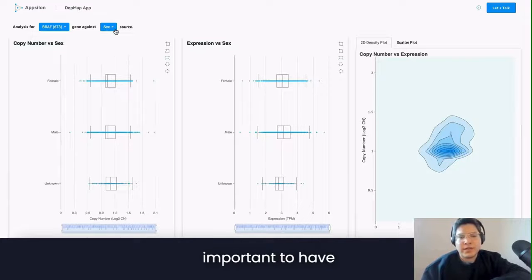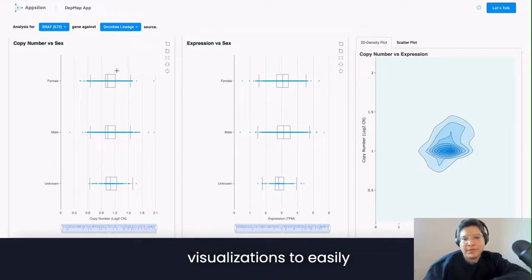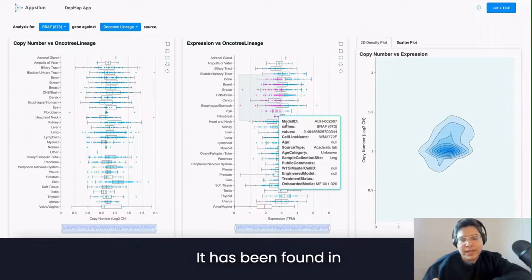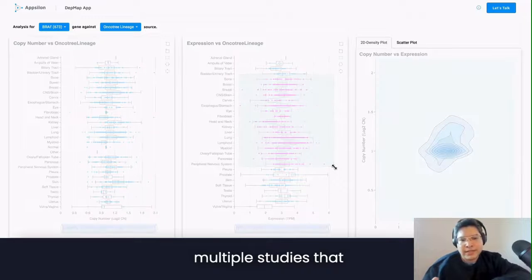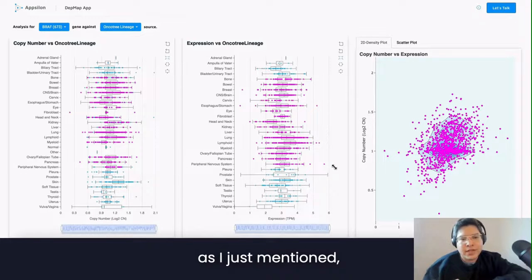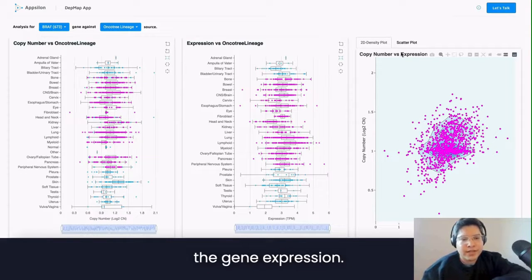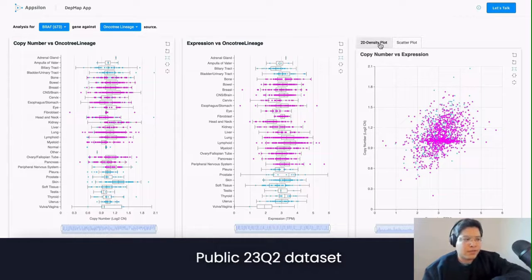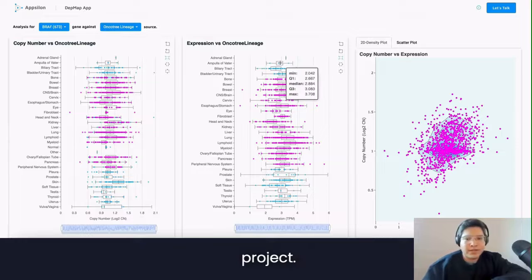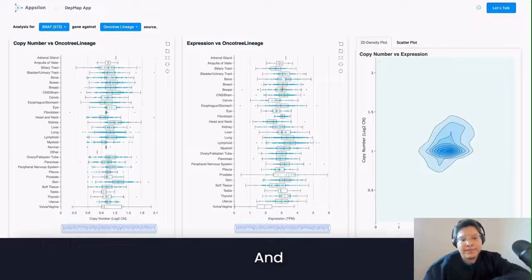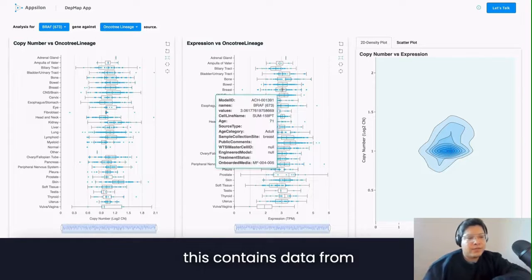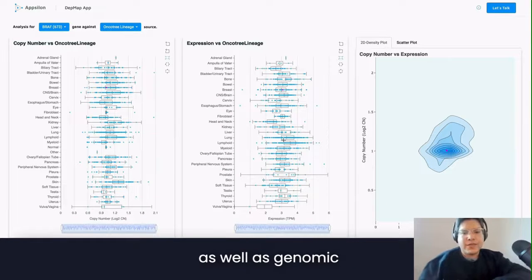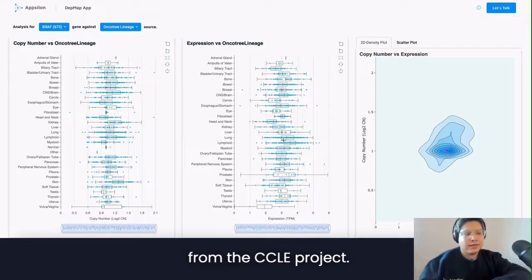This is why it is important to have this type of visualization to easily correlate what happens between those two. It has been found in multiple studies that CNVs are heavily correlated to gene expression. The dataset that we are using is the DepMap Public 23Q2 dataset from the DepMap project, which contains data from the CRISPR knockout screens from Project Achilles, as well as genomic characterization data from the CCLE project.